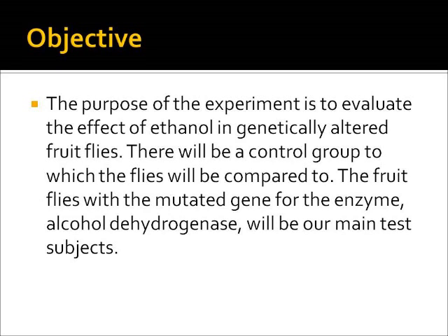So the purpose of this experiment is to evaluate the effects of ethanol in flies which have altered genes, such as ADH plus and ADH minus. There will be one control group to which the flies will be compared. The fruit flies with the mutated gene for the enzyme alcohol dehydrogenase will be our main test subjects.